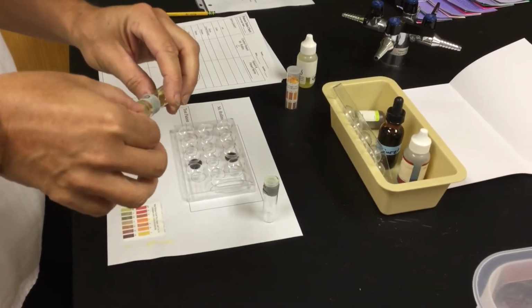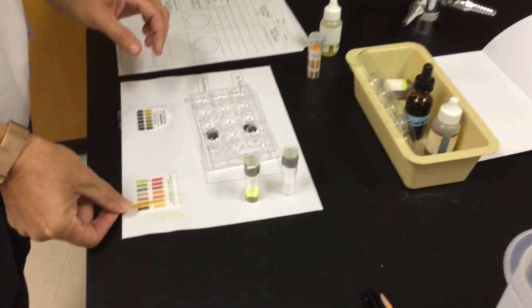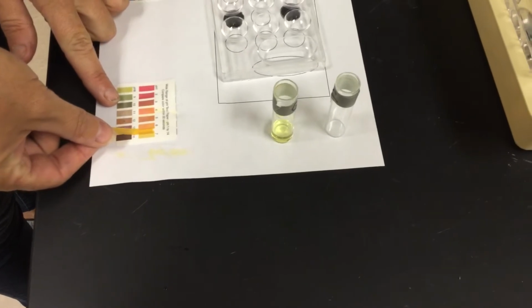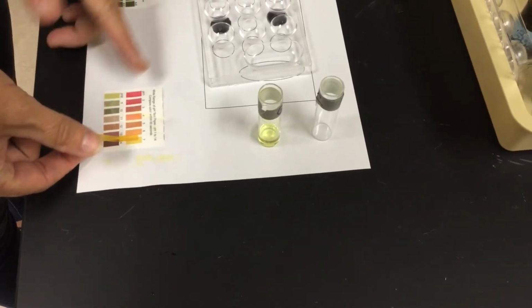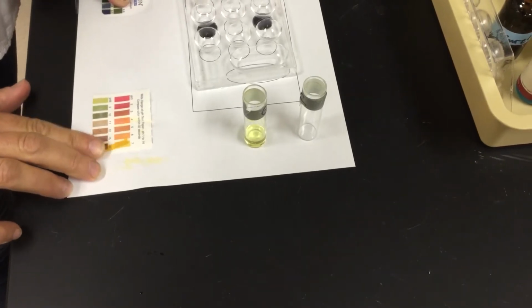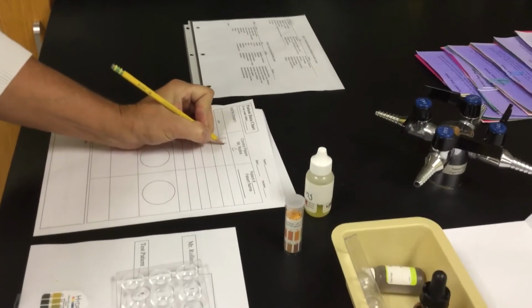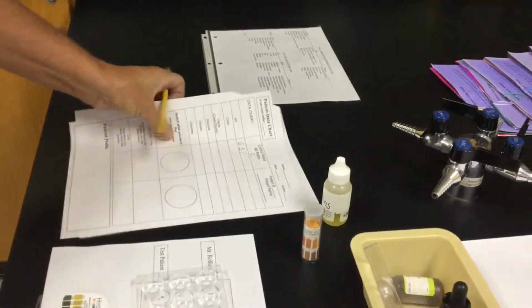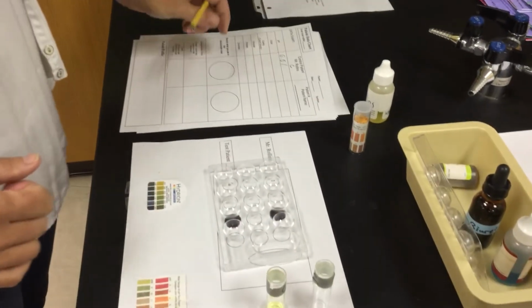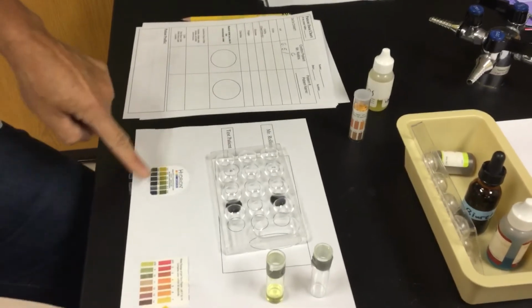You'll take it, dip it in, it should change color, and you want to match it up to where we have on this particular sheet. So these go by whole numbers, so I would say it's probably about maybe 6.5 or so. And you want to match that up pretty quickly before it dries. So I would say, okay, well, it's about 6.5 is my pH. But I'm going to go a little farther than that, because we have a second type of pHydrion paper that goes a little bit more in detail. This pHydrion paper will go from 5.5 to 8.